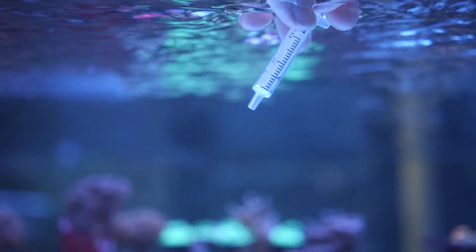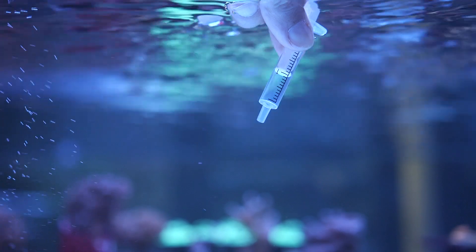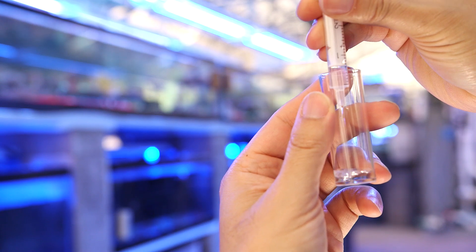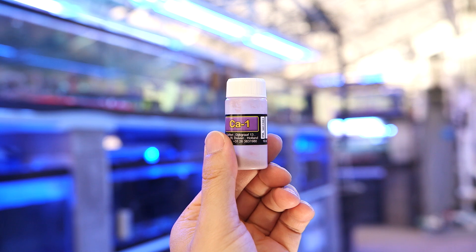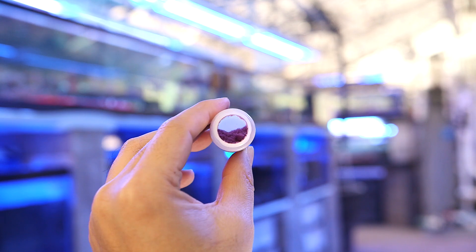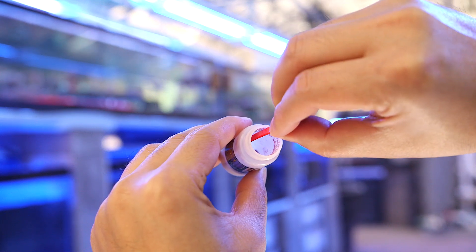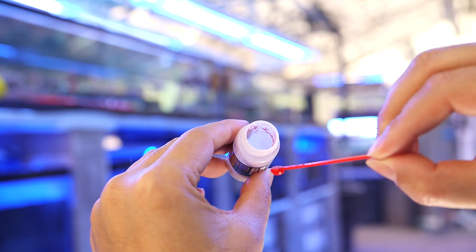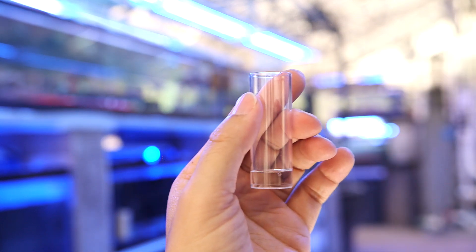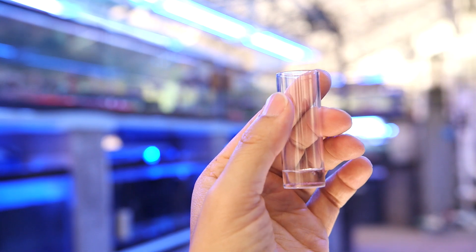Let's start by getting 2 mLs of tank water. I pushed out a little bit of air in the syringe and then put it into the sample container. Now let's add the first reagent, which is this purple powder. By using the supplied red spoon, we want to take a level spoonful and add that to the sample. The way to get a level spoonful is to scrape it against the container as you take the spoon out. This particular kit says to not stir the powder in, so we'll just dump it in there for now.